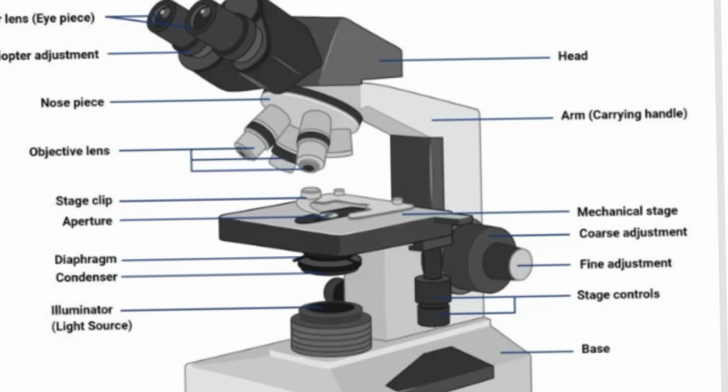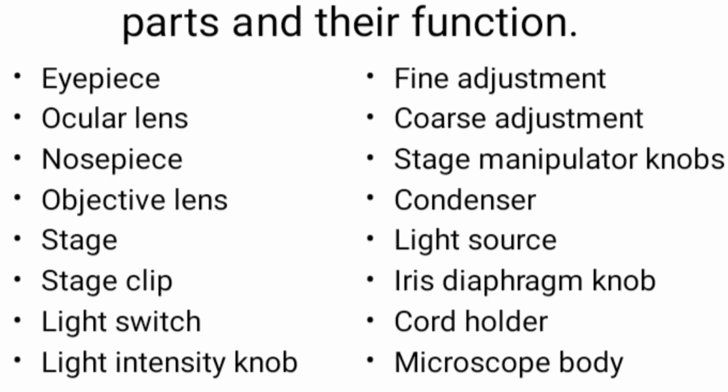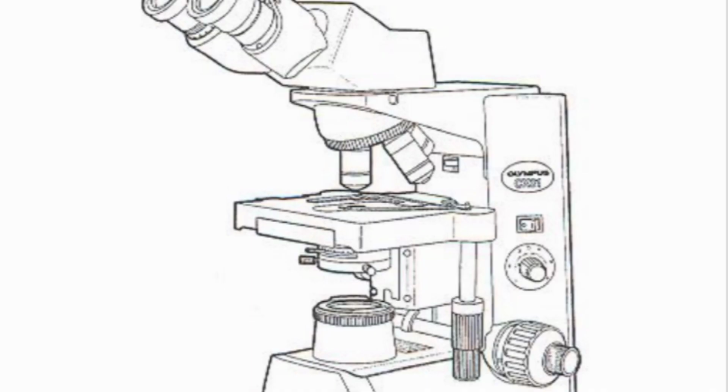So these are the functions and the locations of the parts of the microscope, but I will try to make an abridged version of these functions and put it in a slide. So if you need it, you can let me know. I will send it to you. All right, let's go to the next slide. Try to study more on the parts of a microscope, and also please master their functions. It is very important.